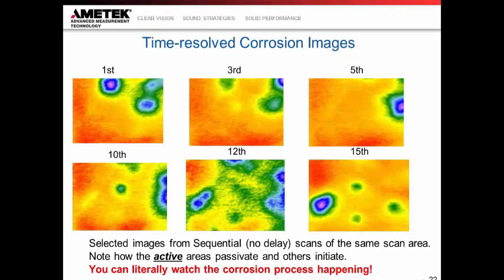Another comment is that you see a lot less pixelation in this image. Because I'm looking at a smaller area, I can look with smaller pixels. So these were 50 microns by 50 microns. So the amount of data in this plot is 4 times the data density in the last plot. So that's why the pixelation looks a lot better. And so people use that word, they'll look at this and look back at the previous graph, and they'll say these resolutions are a lot better. I kind of define this as pixelation because I think about resolution as spatial resolution, electrical sensitivity, not necessarily just how clean and pretty the image is.